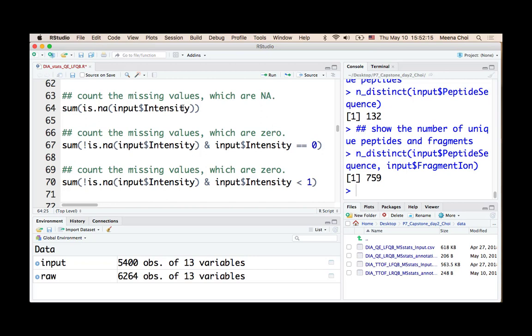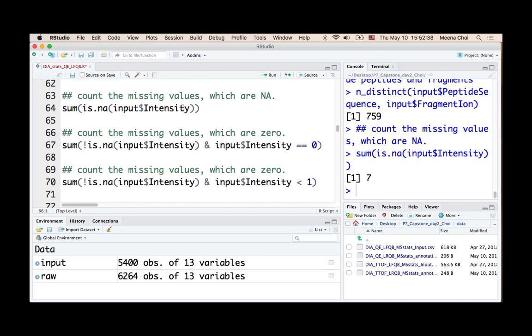First, when I read the data for processing, I just double checked our number of proteins and peptides and so on, double checked our annotation, and then double checked the missing values because it can sometimes make a difference. As I briefly mentioned before, Skyline can distinguish 2 different types of missing value. So here we can actually count how many of each type of missing value we have.